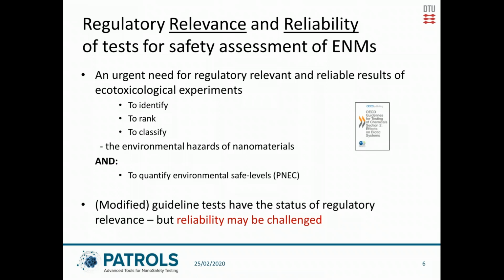This is because there's an urgent need for tests that are actually relevant and reliable when we want to identify, rank, and classify nanomaterials for their environmental hazards. And as illustrated, it's often the OECD guidelines that govern this. But there's also a need to have relevant and reliable methods when we want to establish safe levels in the environment, the so-called predicted no effect concentrations.